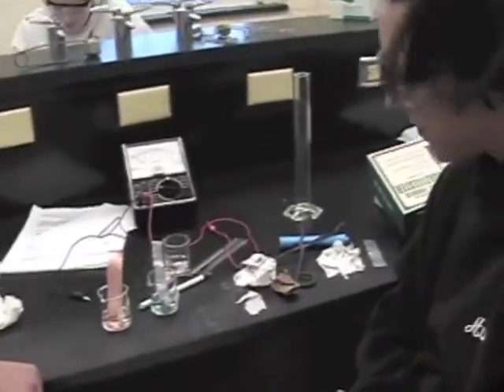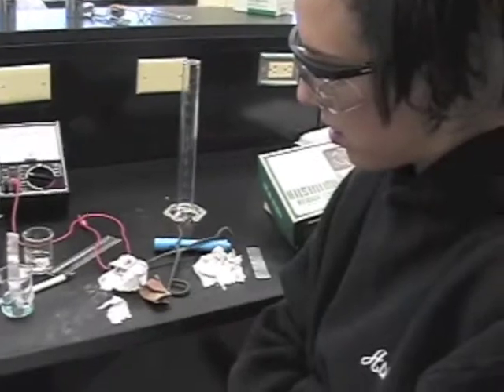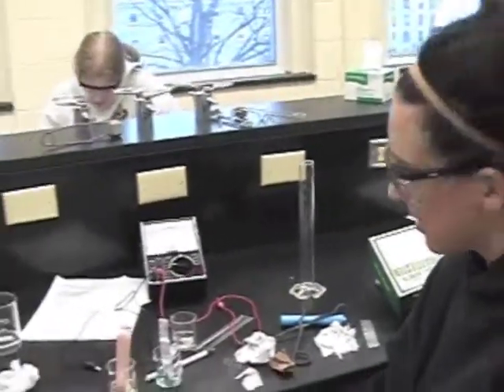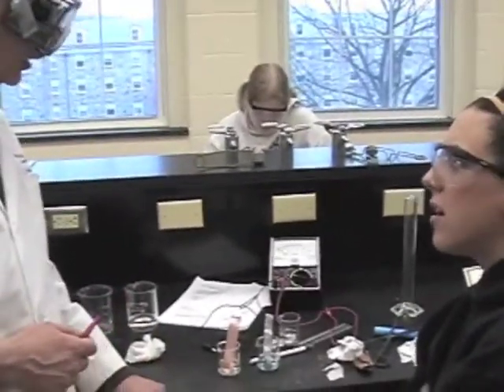And what else is in the solution? Sulfate. Sulfate. Yes. Okay. So if you have lead ions and sulfate ions, are they going to be soluble or insoluble? Insoluble. That's right. Lead sulfate is insoluble, and that's the white solid. The other things that you make, the salts, are soluble, so you don't see that striping like that. Okay.